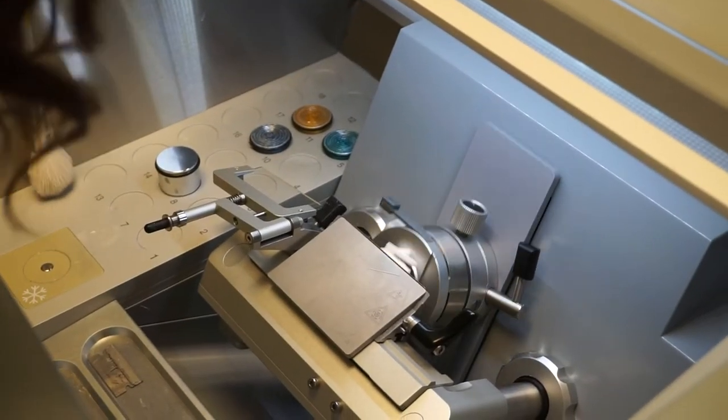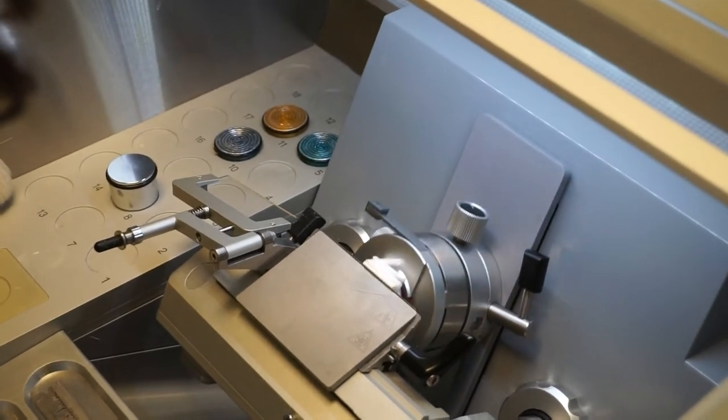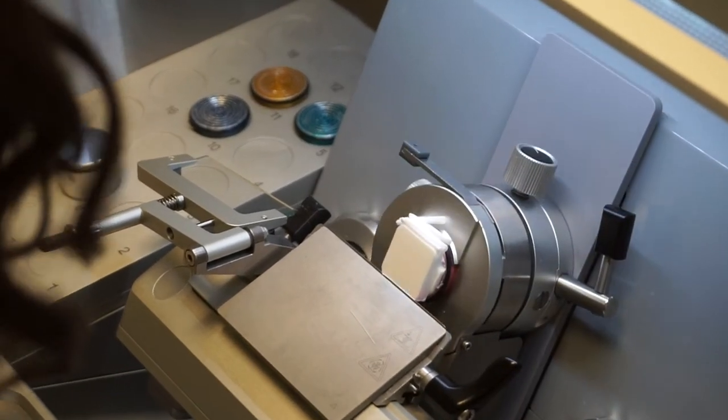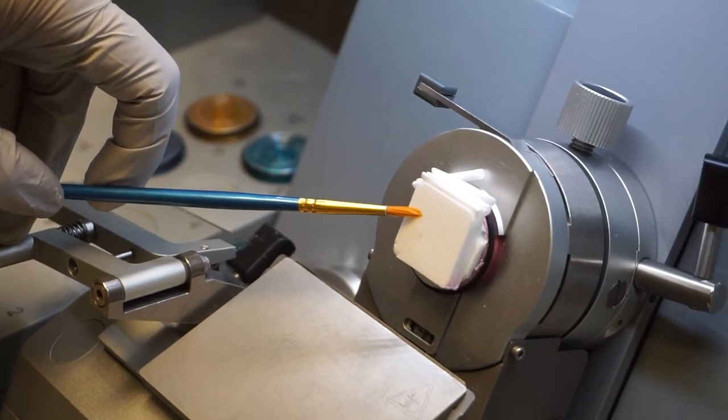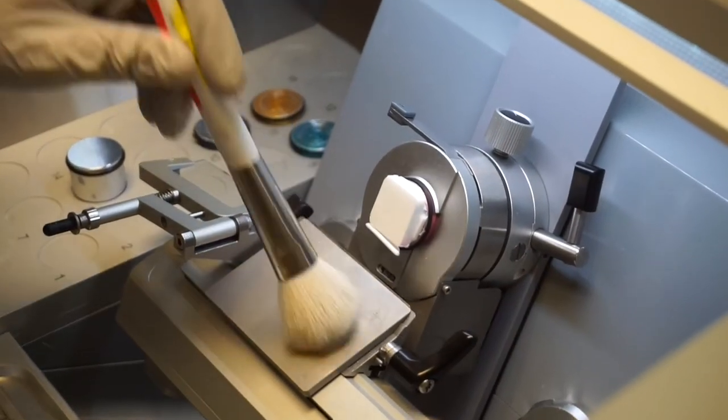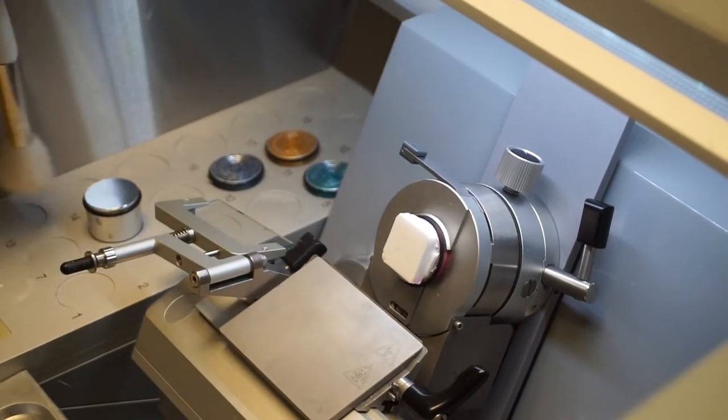Use the cryostat trim function to shave off excessive OCT. When samples start to become visible on the surface of the block, set the cutting thickness to the desired value and continue trimming until samples begin to be cut.